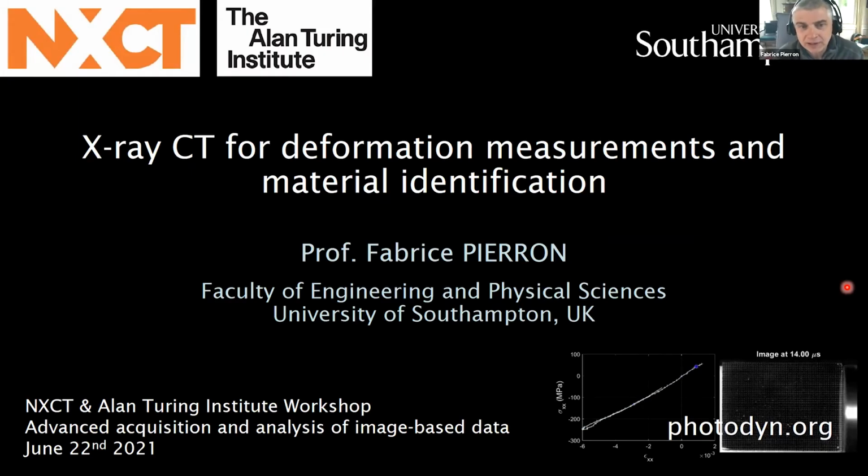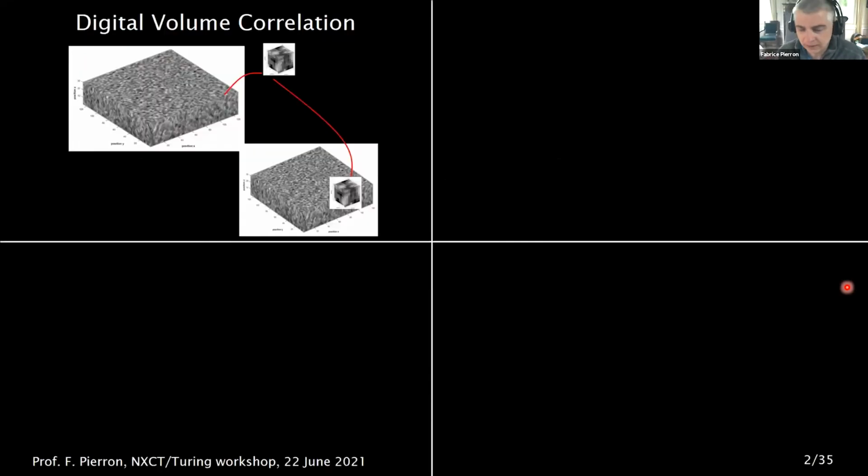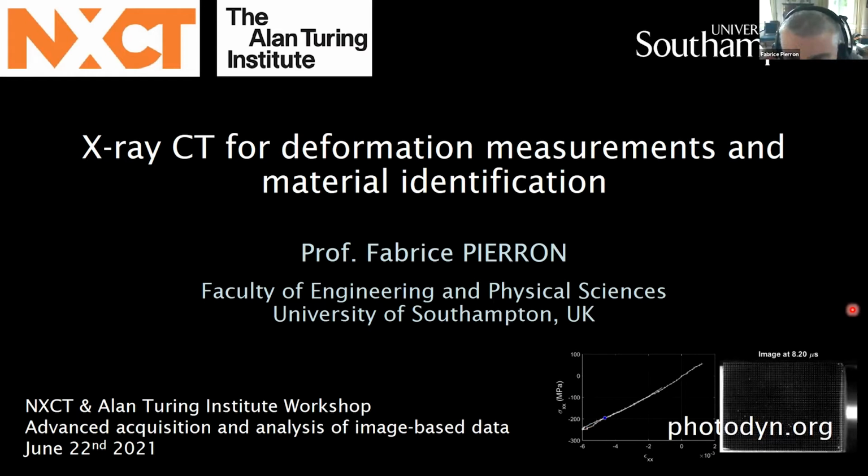The presentation is going to be more like my own thoughts, really, on the issue of the use of CT data to measure deformation, which is my main interest, and also to go from deformation to material identification.